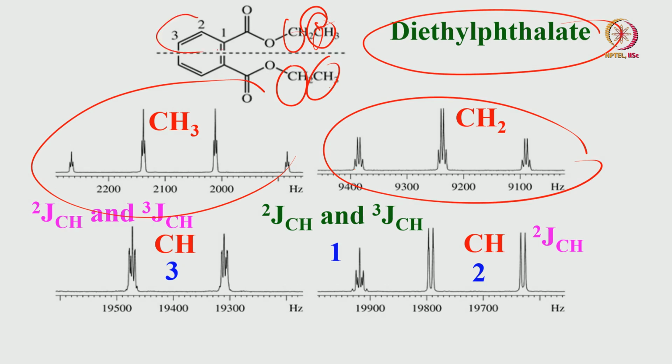And we also have 3 different protons. There is a symmetry along this axis for this molecule. There is a quaternary carbon, and these 2 protons are single proton attached CH carbons. So, as a consequence they are doublets, but of course they can have long range couplings. So, this is a very simple spectrum of this molecule.